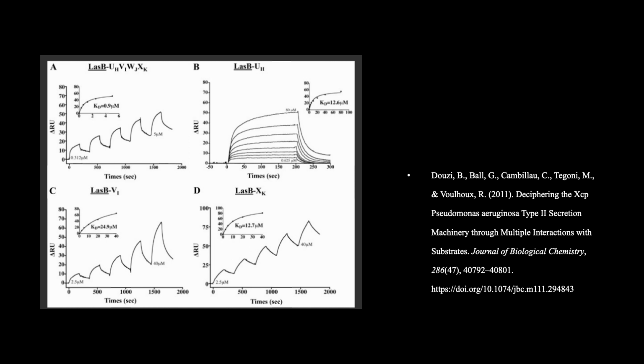Overall, the figure is showing that there are binding events that are specific interactions between the LasB and the specific components that are U, V, and X.